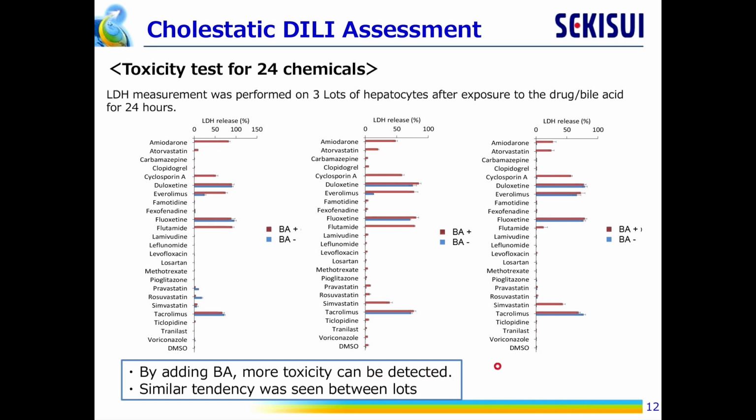Two assumptions can be made from this data. One, the presence of bile acid is associated with higher LDH release, so by adding bile acid, higher toxicity levels can be detected.